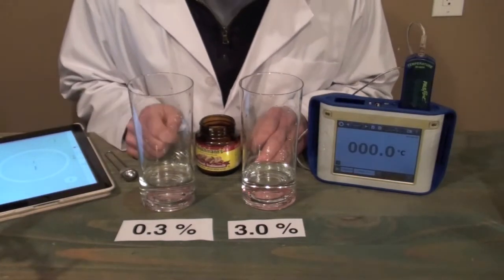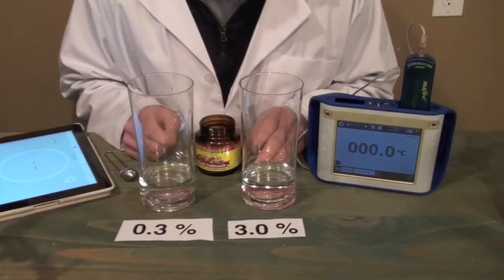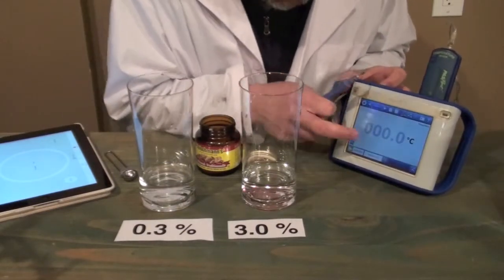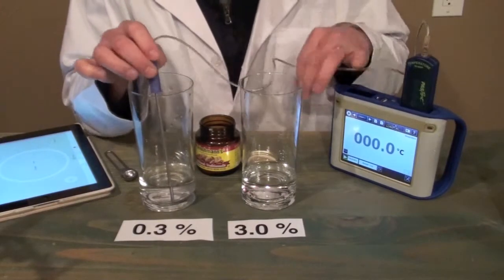And we'll also observe to see how much bubbling takes place, because again, remember, this decomposition reaction produces oxygen. So let's get started by measuring the starting temperature of the first container.